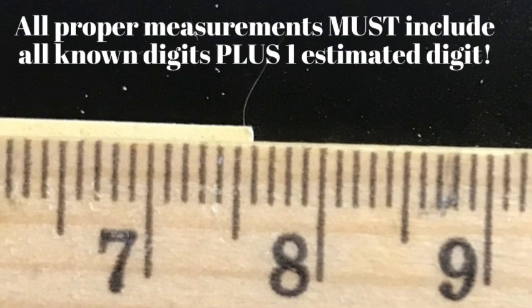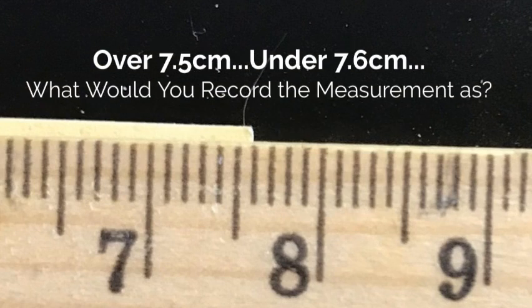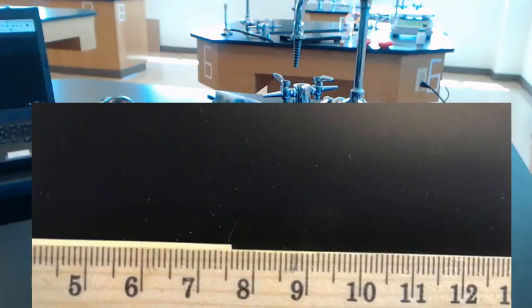All right. You have to estimate a single digit for every single scientific measurement that you take. So for the post-it note, it's over 7.5, but it's not quite yet to 7.6 centimeters. So my measurement, I'm going to try to get as close as I can. If it's between 7.5 and 7.6, I'm going to call it 7.55 centimeters. That is my measurement.